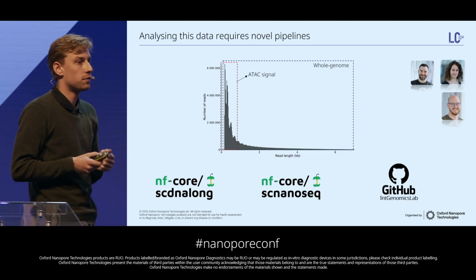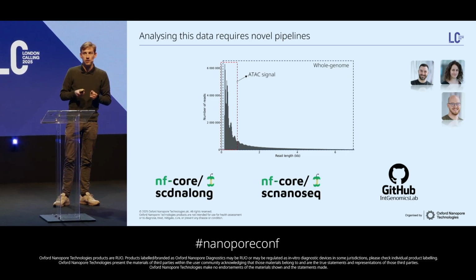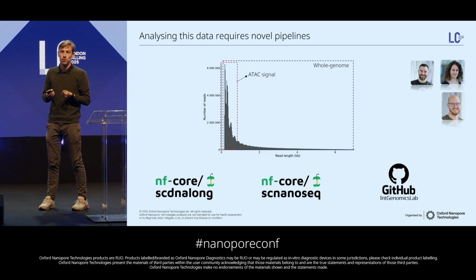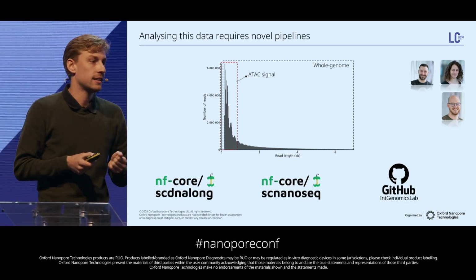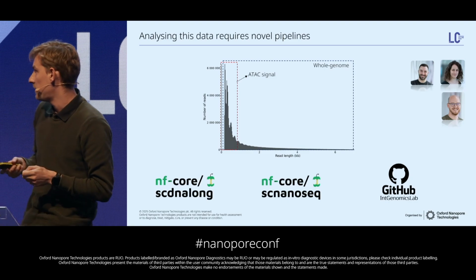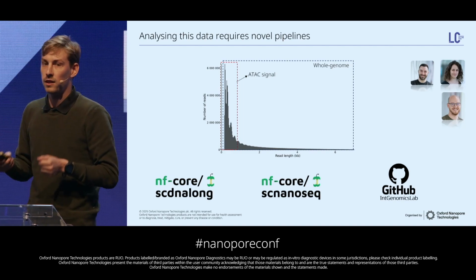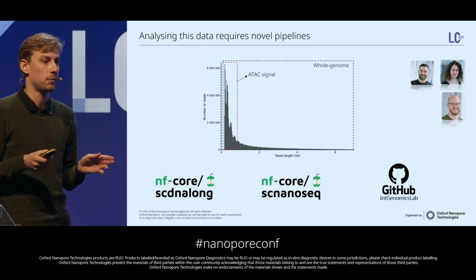And so maybe the most difficult part about this multiome is actually doing the downstream analysis, as this is definitely not standard. To do this, it was not my work alone, but the whole lab, especially Marius, Alex, and Luke. Single-cell long-read transcriptomics is getting more and more common, and there are some pipelines out there to pre-process it in the form of single-cell nanoseq, but single-cell long-read DNA is an altogether different ballgame and actually breaks all the pipelines.